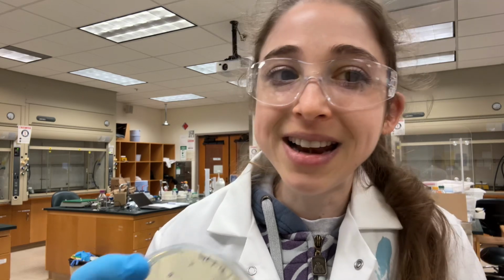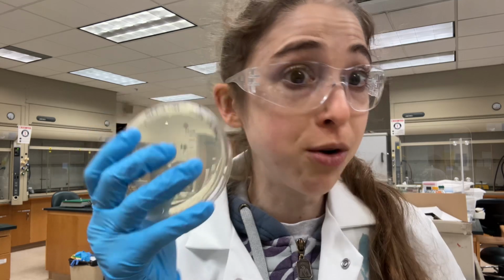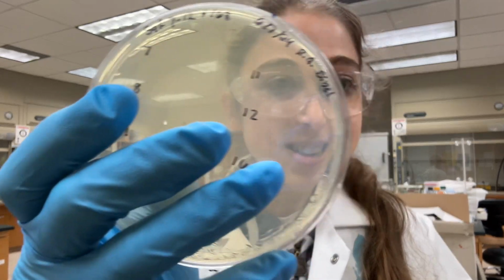And if these bacteria had been able to grow in the presence of kanamycin already, that would not be helpful. So this is really exciting that we didn't see growth. We also didn't see growth in the liquid media, and we're doing some cool diffusion assays to test antibiotic susceptibility to other things. More on that later. But really exciting. Probably one of the only times that you want to see lack of growth. Once we do that swappage, we want to see growth, because that'll tell us that we have bacteria that swapped out malate dehydrogenase and put in the kanamycin resistance gene. But for now, we need to know that our wild type is not going to be able to grow, and this lets us know.